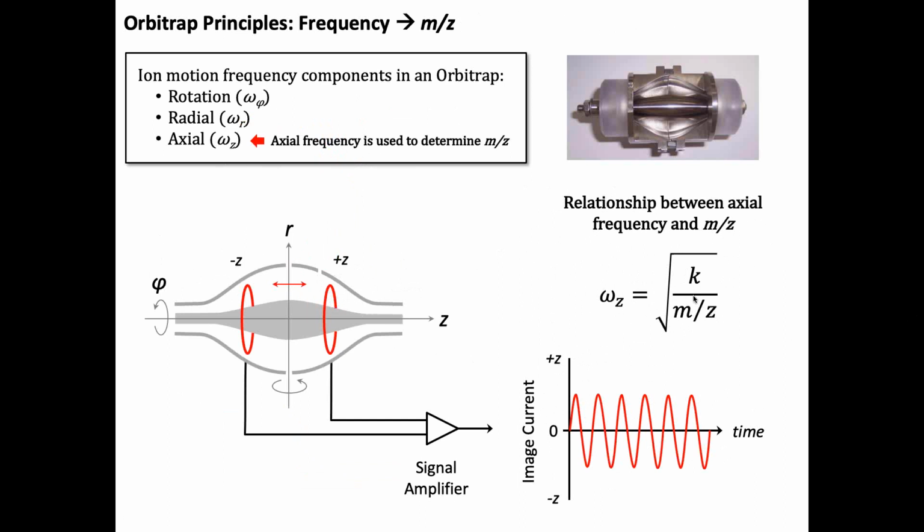Okay, you go to Planet Orbitrap and you look at the products. Maybe I'll try it here in just a minute. I'm not sure. I just don't want to foul up the guys on the Wisconsin side. But if you go to Thermo Fisher Planet Orbitrap and you look at different Orbitrap types, they have these really nice animations that describe things from electrospray ionization all the way through, and they'll show some of these same types of pictures but animated, which will probably be a lot more informative, or it'll make more sense once you see that as well.